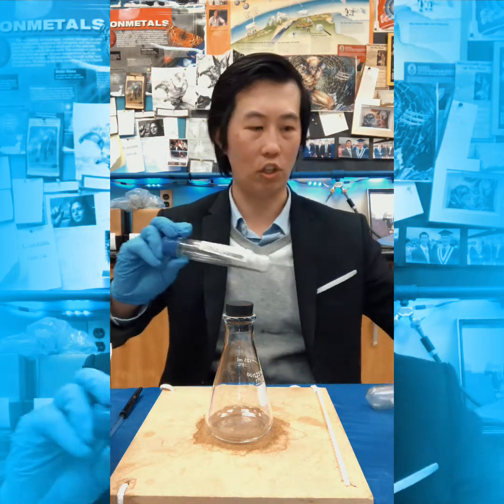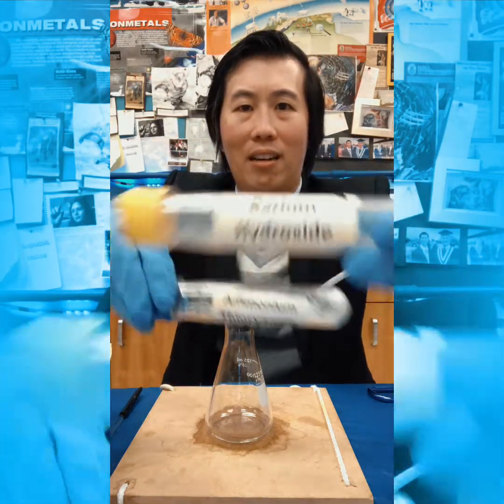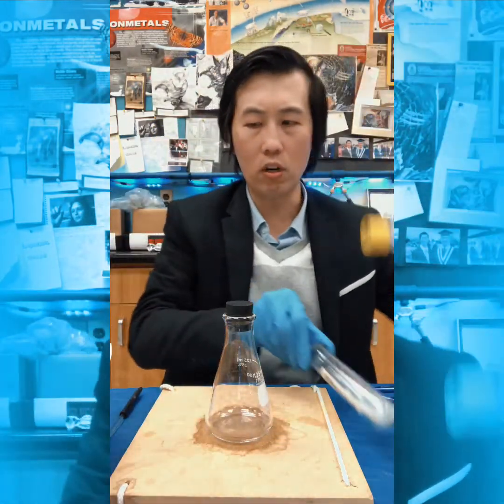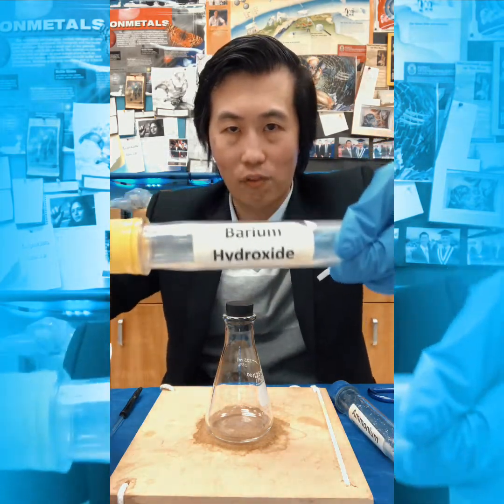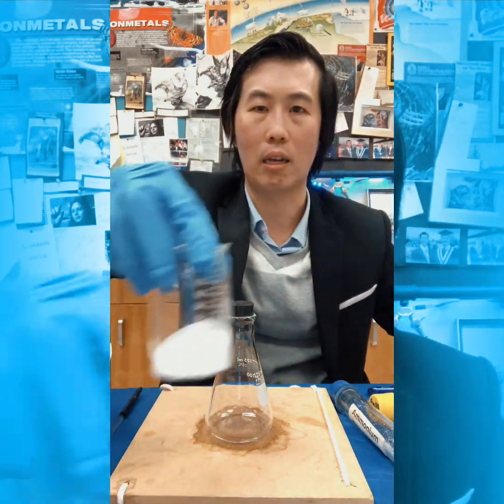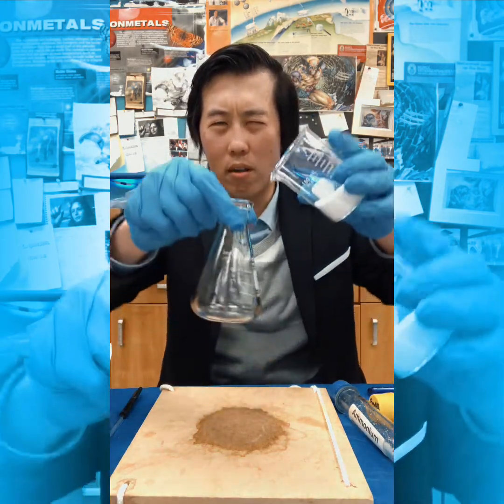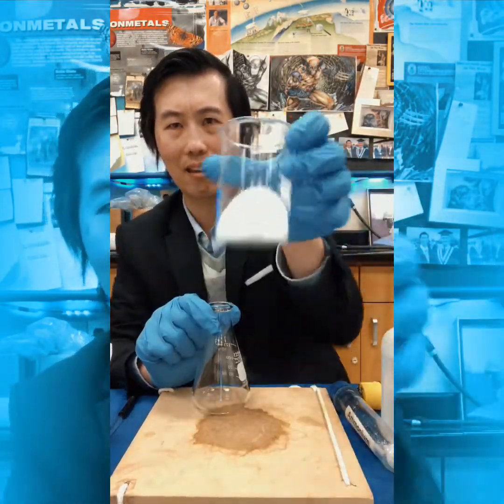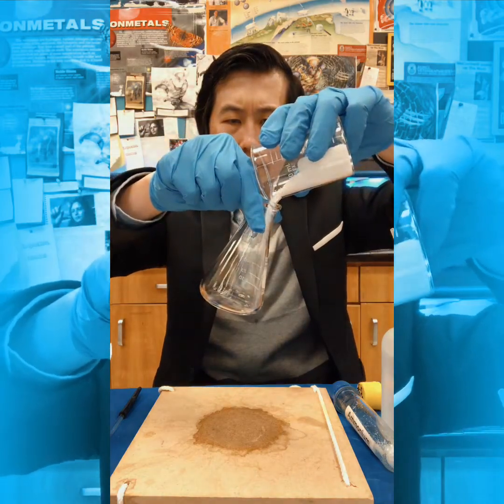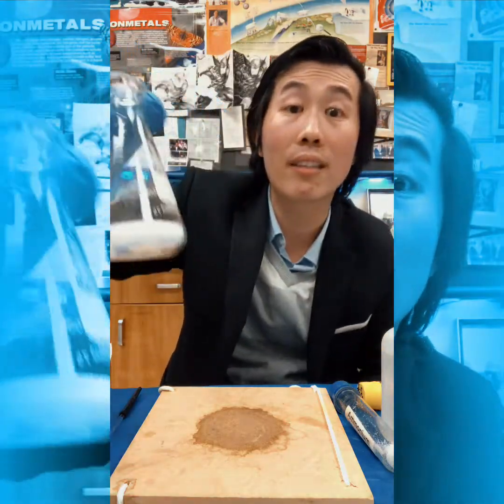Today, I have two chemicals to show you, a very classic example similar to cold packs. We have barium hydroxide and we have ammonium thiocyanate, okay? The first one I want to show you is the barium hydroxide. It is right here in this little beaker. I want to pour that in here, and notice that this barium hydroxide is a solid. So we're going to pour that in there. Excellent. Okay, notice it's in a solid state.